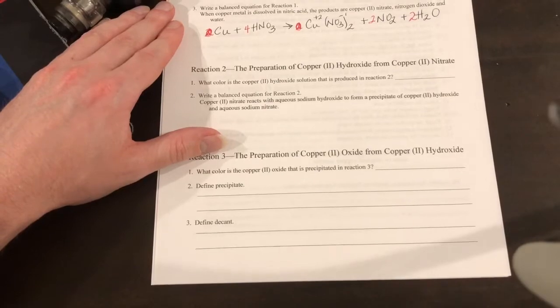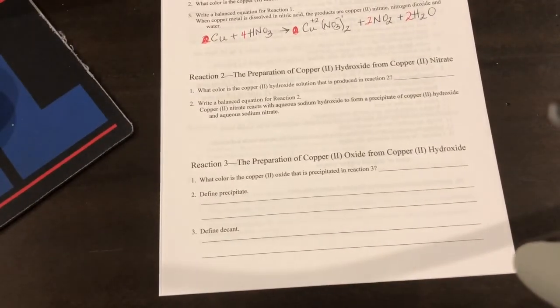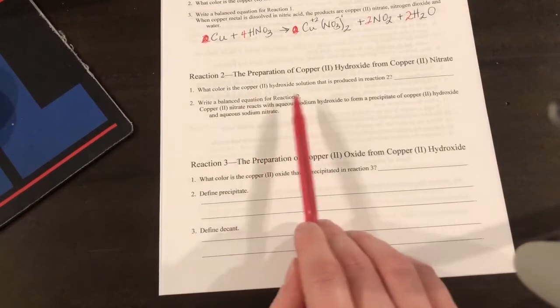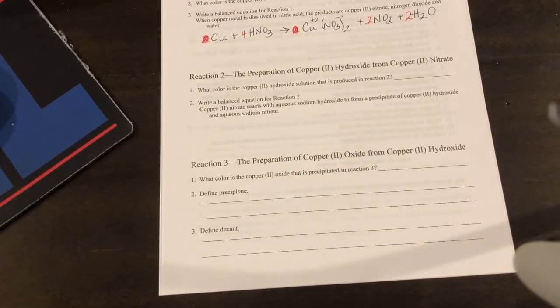So we're going to go to our data table and look at the preparation of copper 2 hydroxide from copper 2 nitrate. So this is reaction number 2. What color is the copper 2 hydroxide solution that is produced in reaction 2? You can get that from the video. And now we're going to write and balance the chemical equation for this.